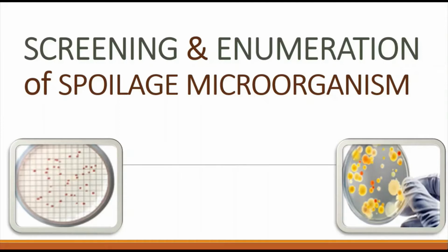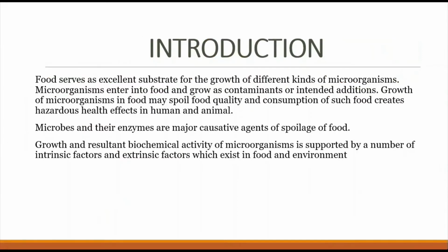The enumeration of microorganisms is especially important in food microbiology as well as in dairy and water microbiology too. Knowing the bacterial or microbial count in drinking water or fresh milk, buttermilk, yogurt can be useful in many aspects of our food industry, or what we call food microbiology or industrial microbiology.